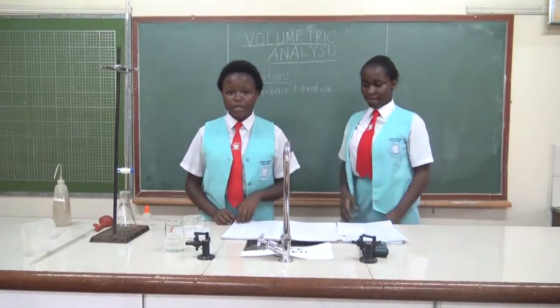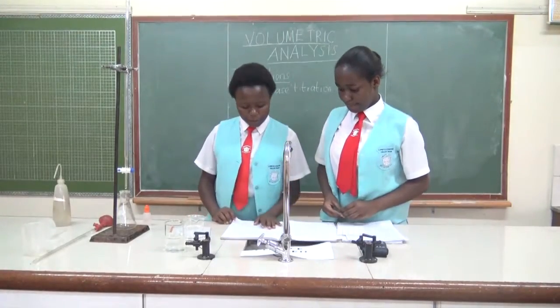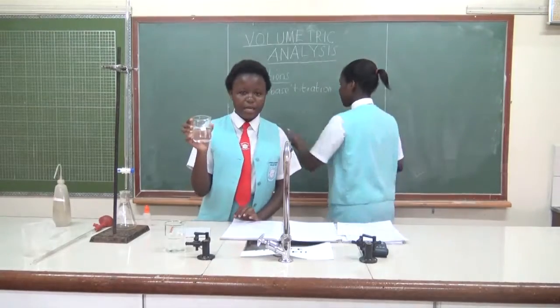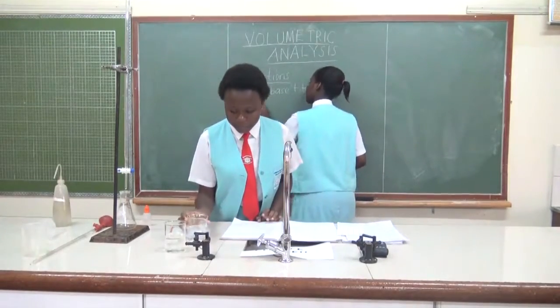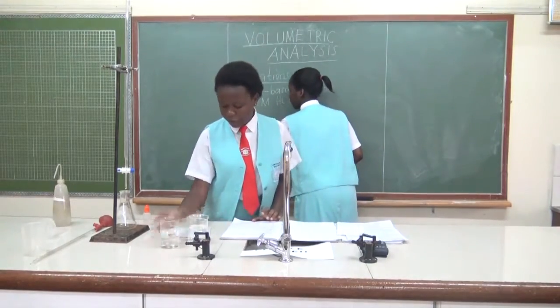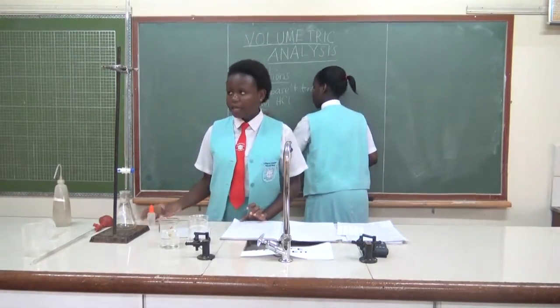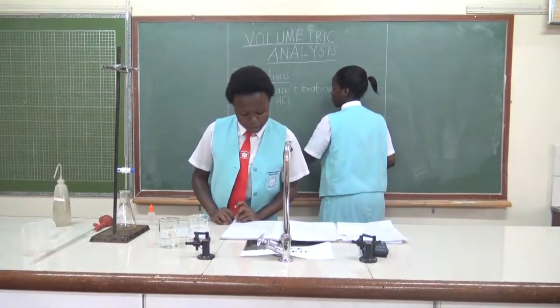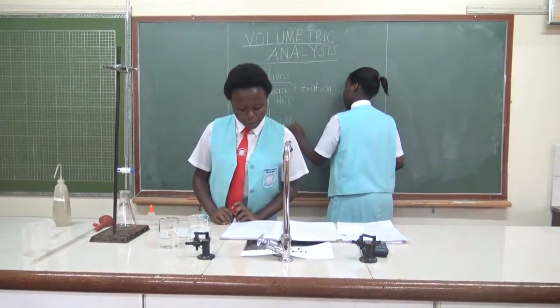Today we are going to do a practical. We are provided with the following: 0.2 molar HCl, sodium hydroxide, phenolphthalein indicator, and the titration apparatus. You are required to determine the concentration of sodium hydroxide in moles per liter.